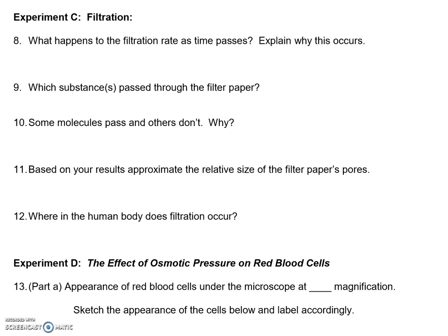In the lab, we would have had a mixture of ferric chloride, which completely dissolves as a salt, and it's yellow and it shows up on the bottom of the beaker. And then we have the charcoal clearly getting stuck in the filter paper because you can see the dark little granules from the charcoal. And then the starch also gets stuck in the filter paper, but you can't really see it because it's white starch particles on white filter paper.